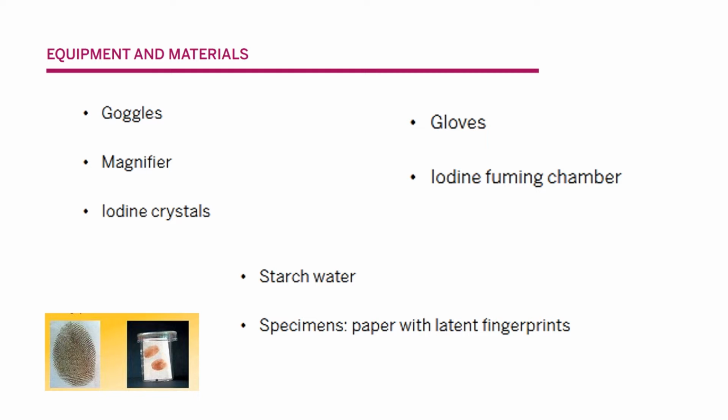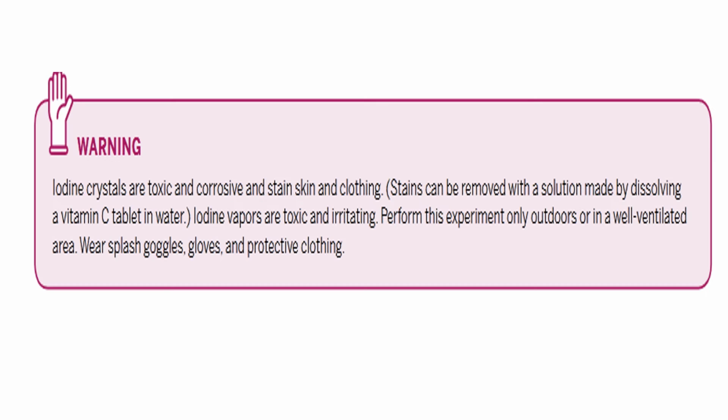Before going to the practicals, we must note down the warning signs. What are the precautionary measures? Iodine crystals are always toxic and corrosive and stain skin and clothing. So don't touch them with your bare hands. Always use gloves.